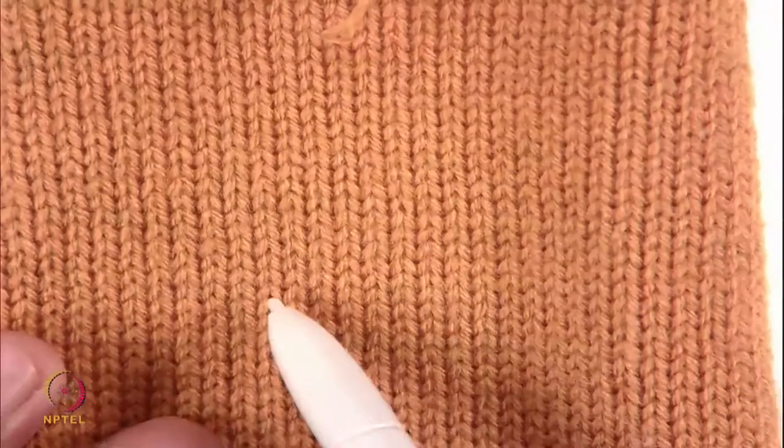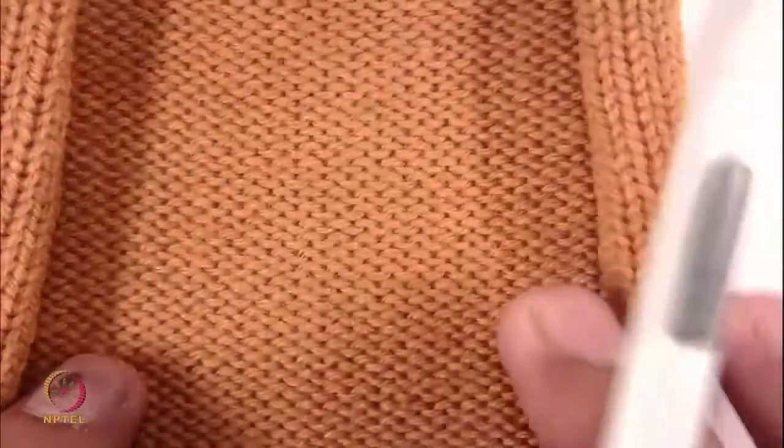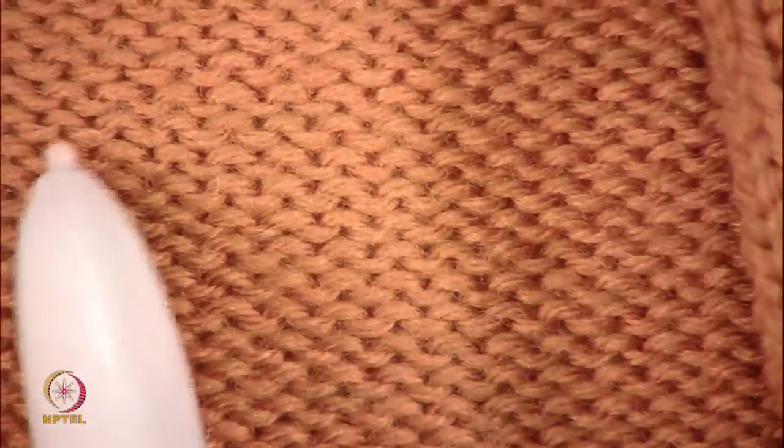But if you see the single jersey fabric structure, which we are going to analyze today, the structure looks completely different. First of all, you can see here, this is the technical front side where you can see the legs. And this is the technical back side where you can see only the head and sinker part. So this is the head part and this is the sinker part.